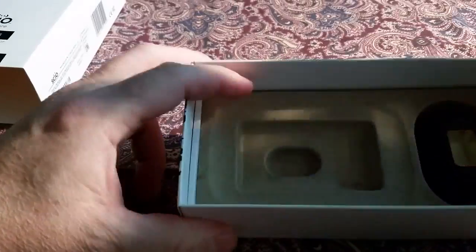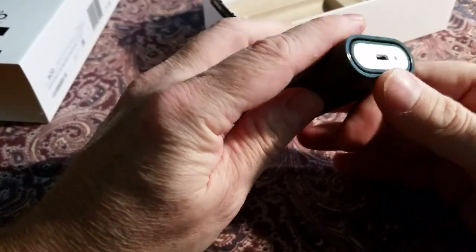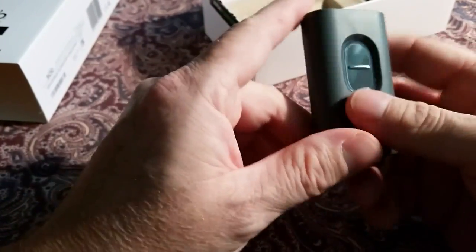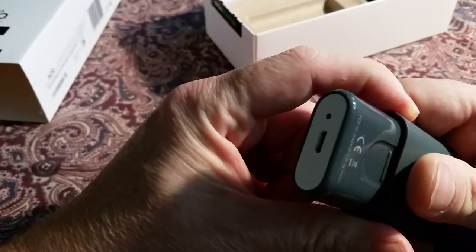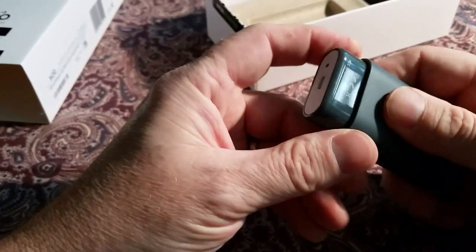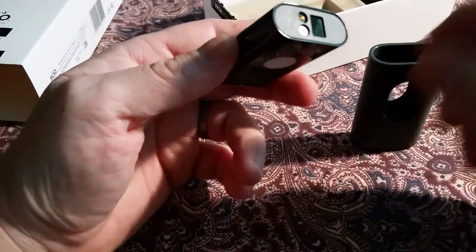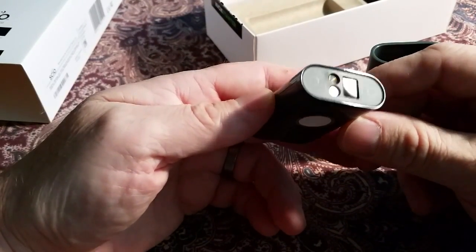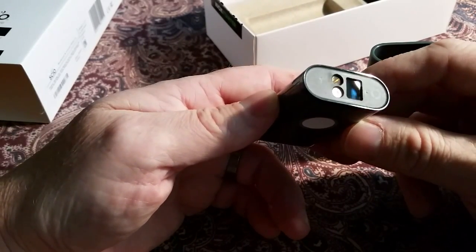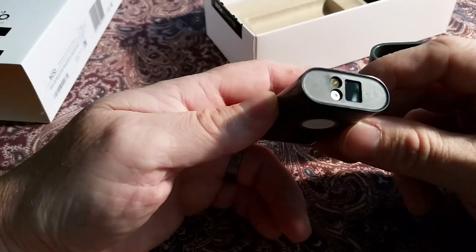The SIO itself comes in a case and has a charge port and a light. There's a finger piece to slide the SIO out of its case. At the business end you have the molecular scanner sensor, a light source, and a temperature sensor.